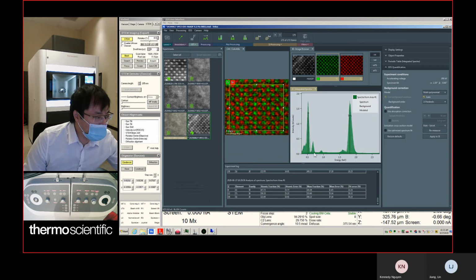This is the background. And this is the phase peak. Residual. You can also bring residual out. You can change the color of them by just right click.